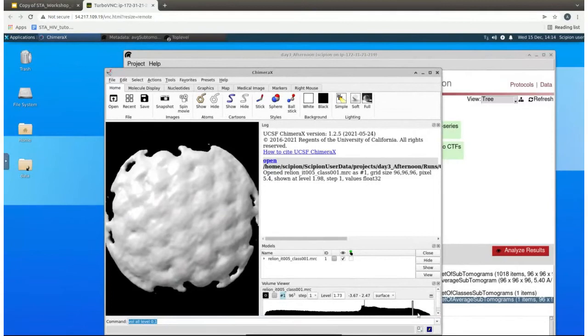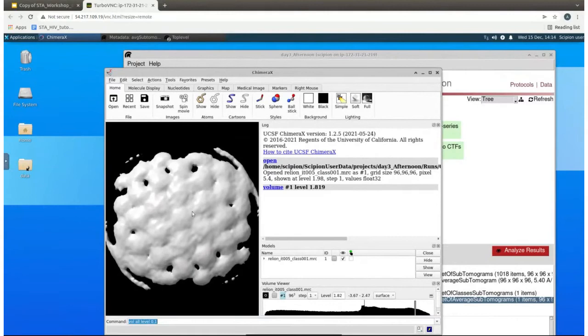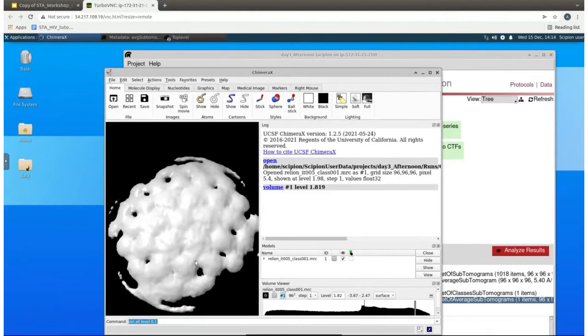So you can see it has improved a bit. We start seeing some features already. No, machines won't work with two RELION jobs at the same time, Pablo, because there's just one GPU. But the next step will be the classification, which will just use the CPU, but you will need the results from this one to run it.